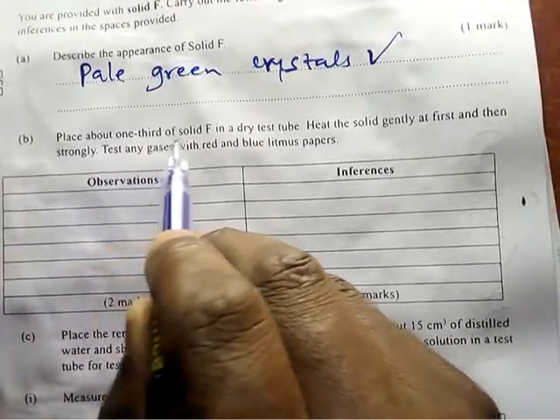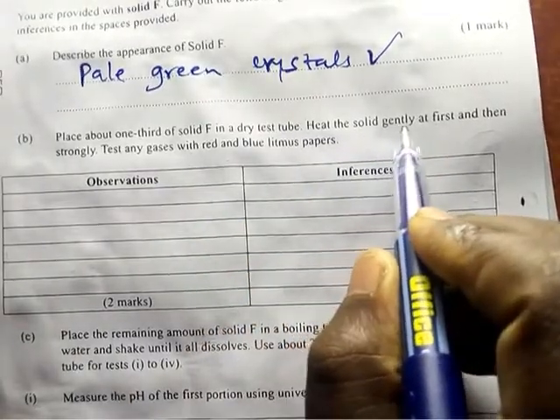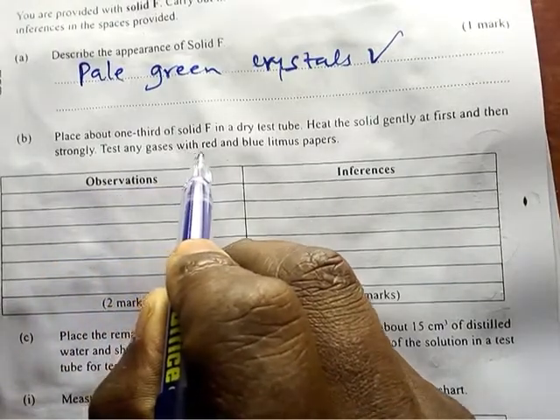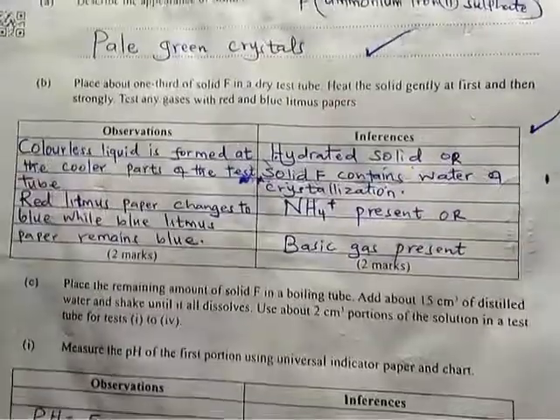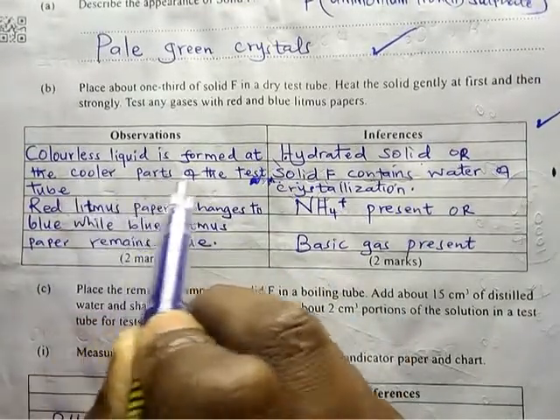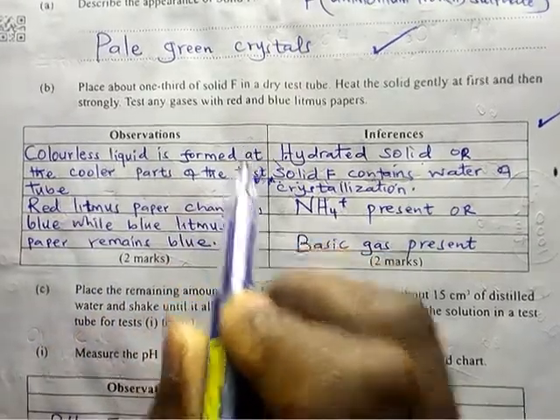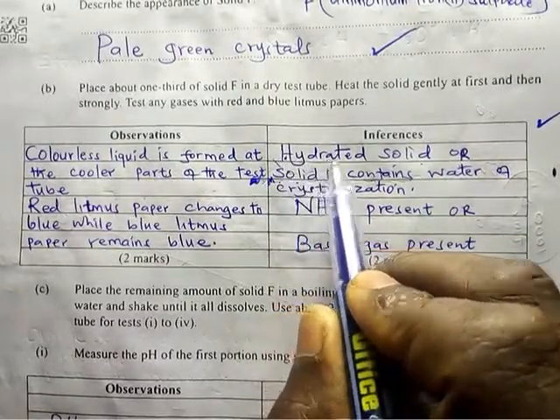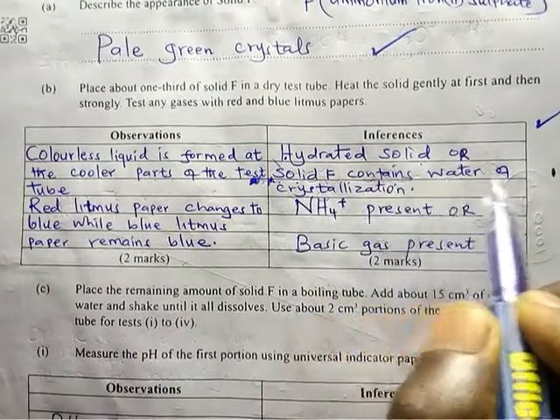Place about 1/3 of the solid F in a dry test tube. Heat it strongly. Heat the solid gently at first and then strongly. Test any gas with red litmus and blue litmus paper. What happened? A colorless liquid is formed at the cooler parts of the test tube. This means that salt F contained water of crystallization. Therefore, the answer should be: F is a hydrated salt, or solid F contains water of crystallization.